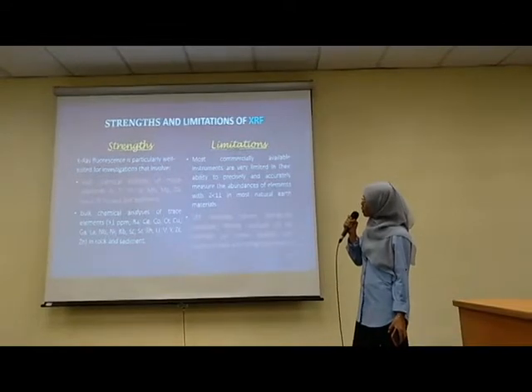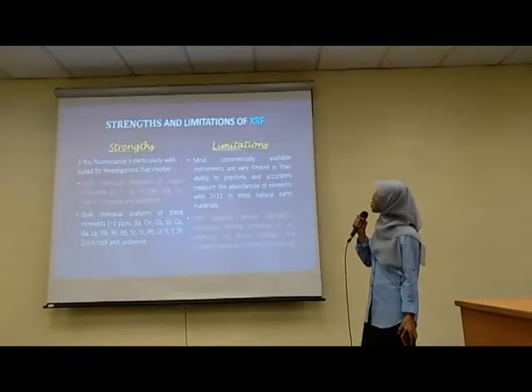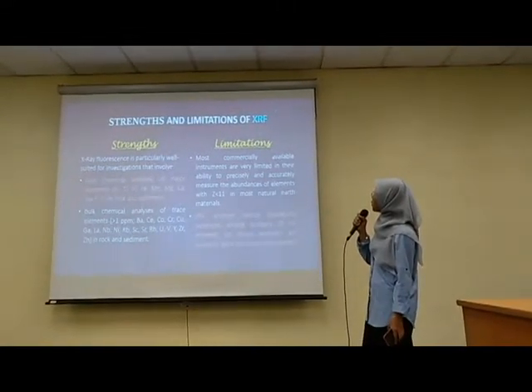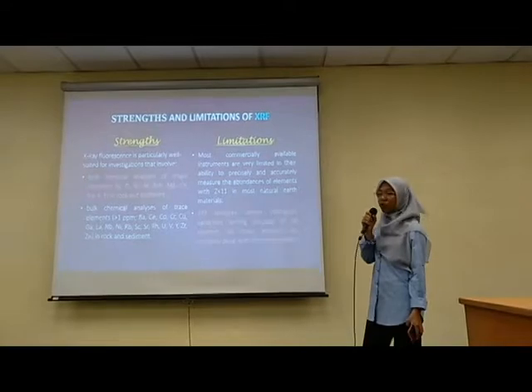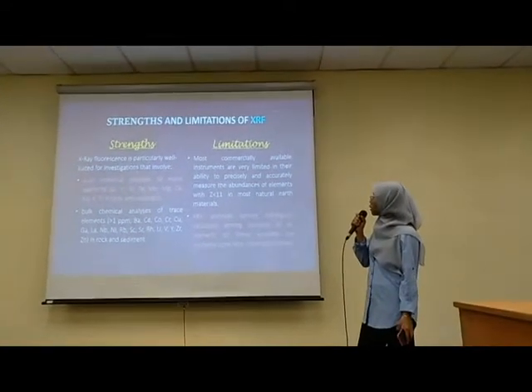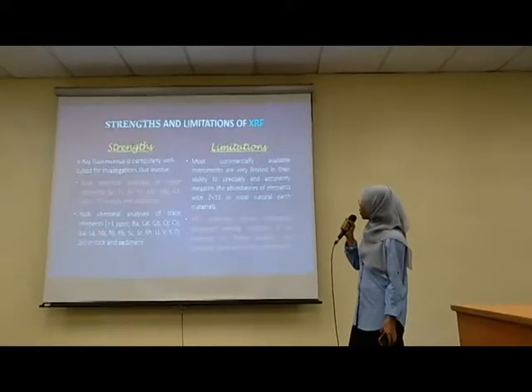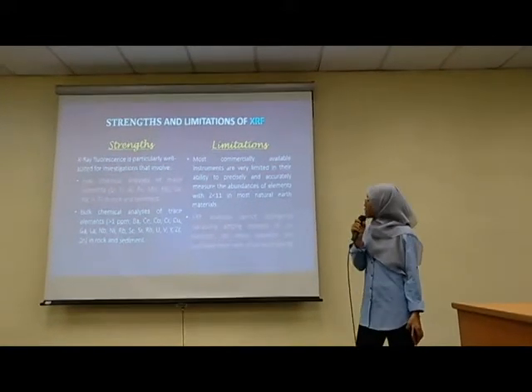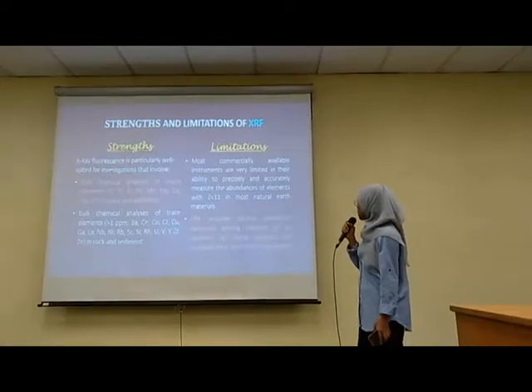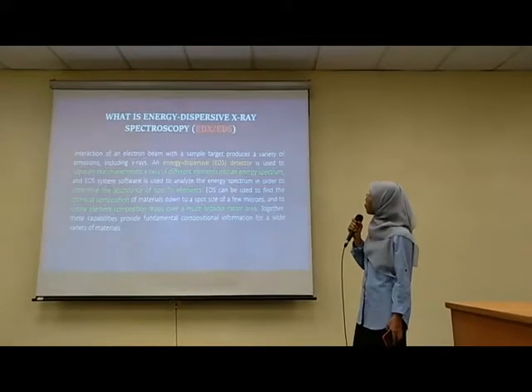But for chemical analysis of trace elements, for the limitations, most commercially available instruments are very limited in their ability to precisely and accurately measure the abundance of elements with atomic number less than 11 in most natural earth materials. XRF analysis cannot distinguish variations among isotopes of an element, so these are routinely done with other instruments.